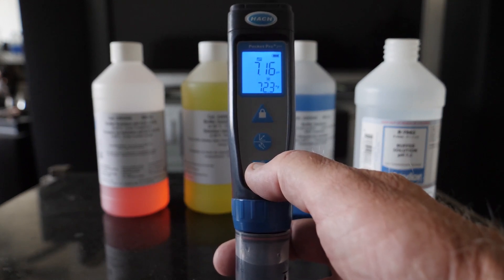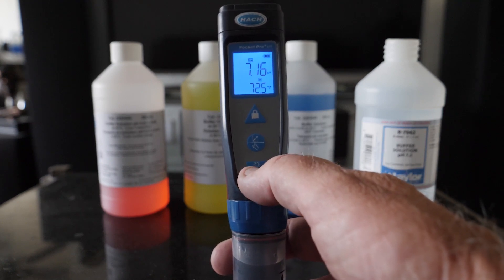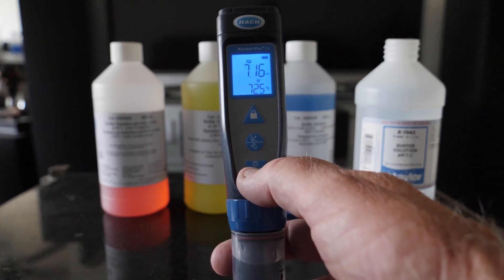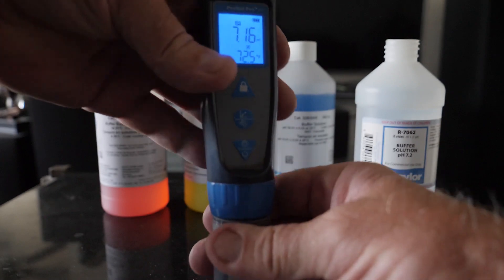Let's see what we got here. 7.16. That's pretty darn accurate — really, really good.